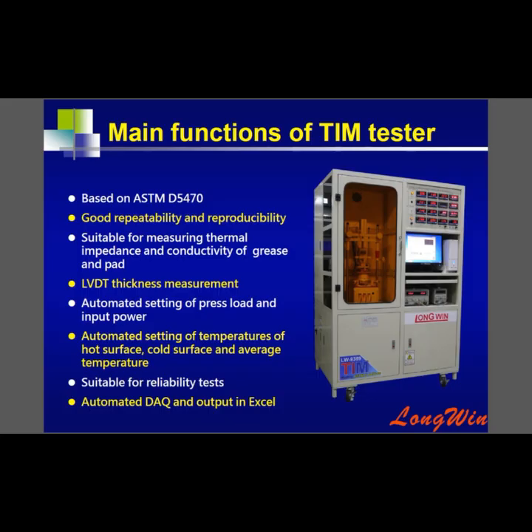This tester is also suitable for reliability tests. And all the data will be exported in Excel. That means you can make your own report easier.